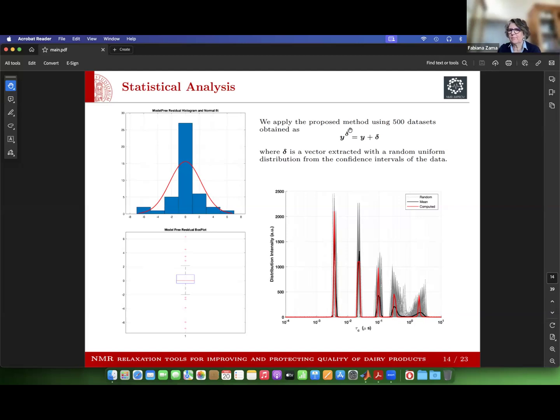Of course, there are other models, but maybe one should be aware at this stage that we can apply your model in cases when the proton relaxation contribution is the dominating relaxation mechanism. Which is, well, quite often for food. What do you think?